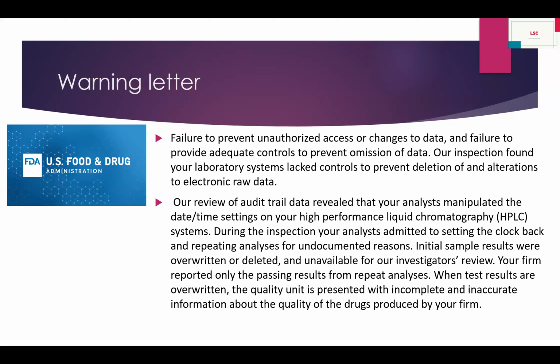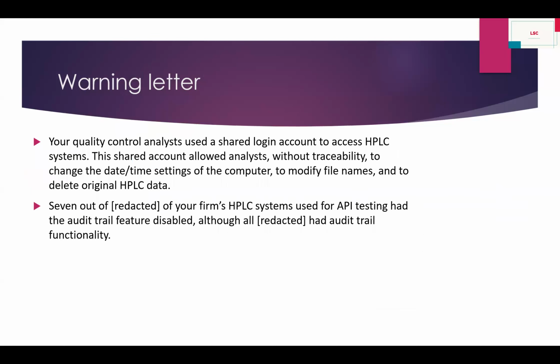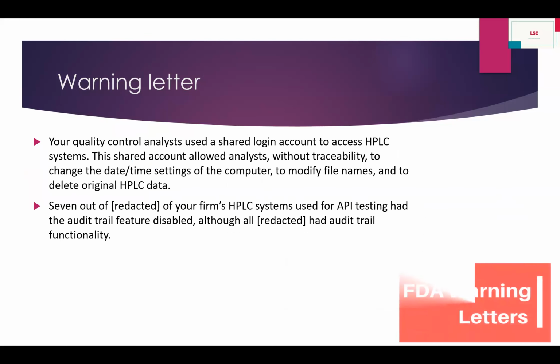And most probably the deletion word should not be in our dictionary, not in our work process. Your quality control analyst used a shared login account to access the HPLC system. This shared account allowed analysts, without traceability, to change the date and time setting of the computer, to modify file names, and to delete original HPLC data. So please don't allow this. Do not use this criteria to touch the date or time. Set your system like this, whatever you are doing, in real time.